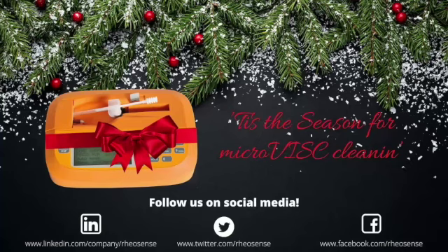So just some of the things to look out for as far as making sure that your chip is in good, healthy shape and that your data is good. So one of the things that we look at primarily is the R-squared value of your measurements, which is reported on the screen of your microVISC.